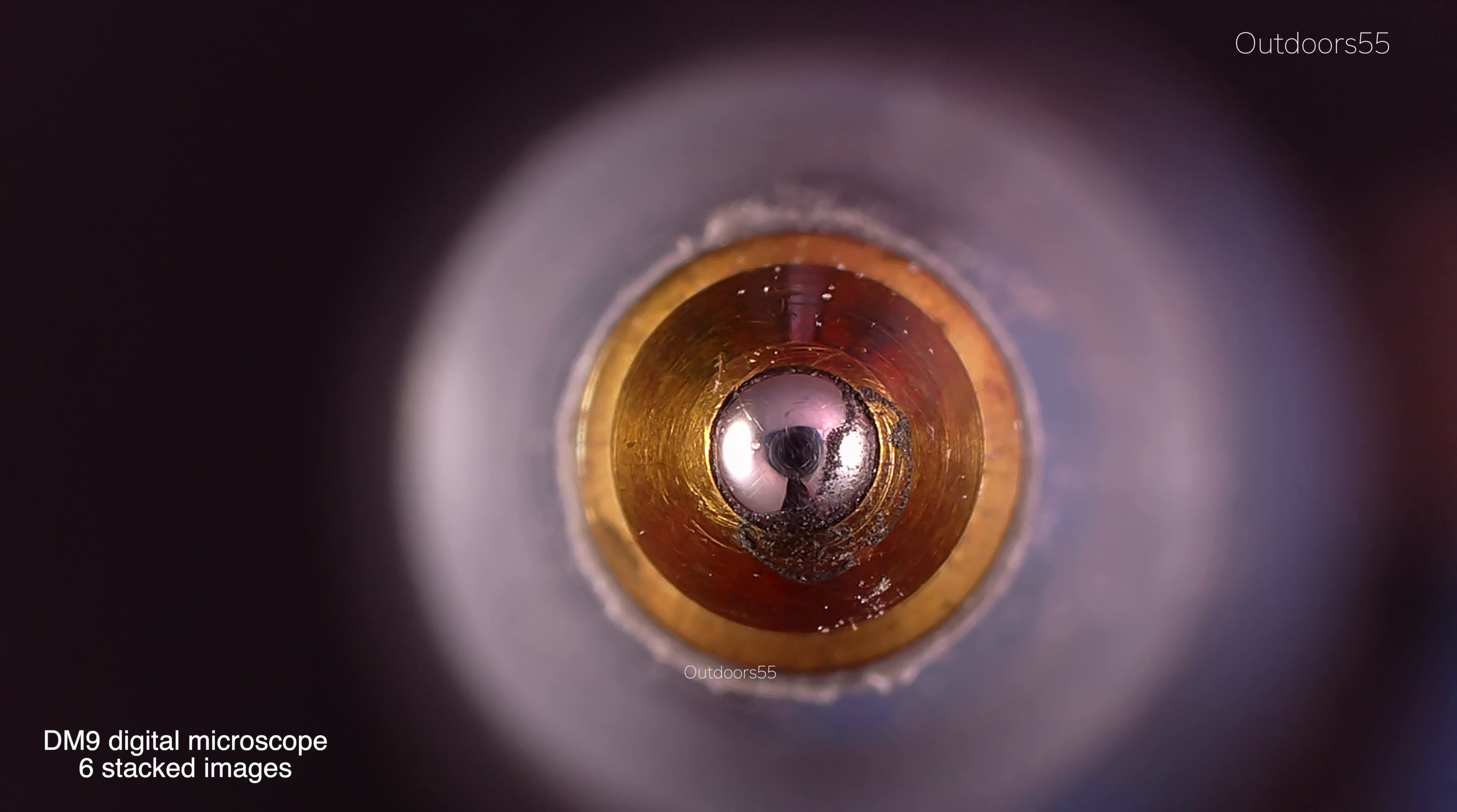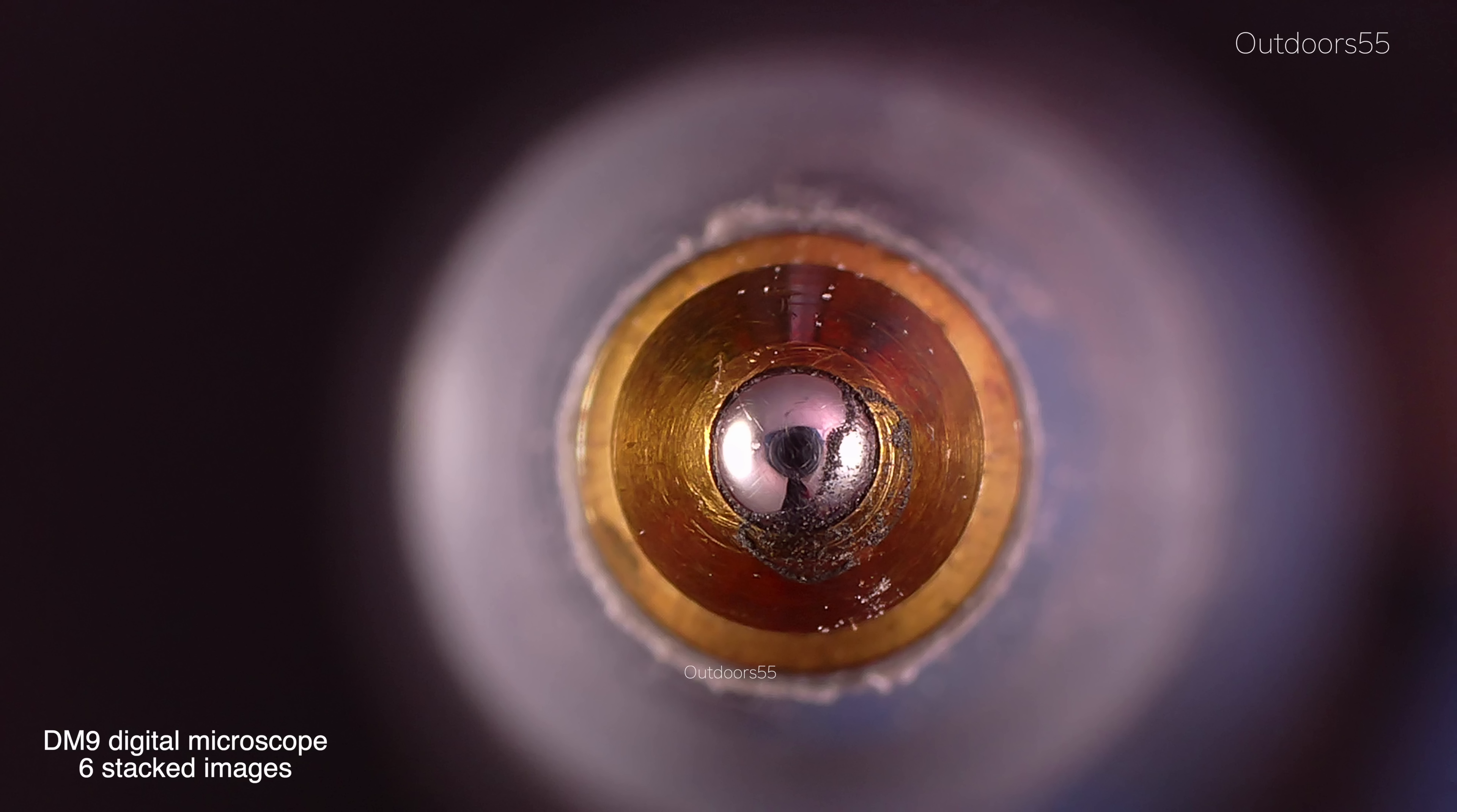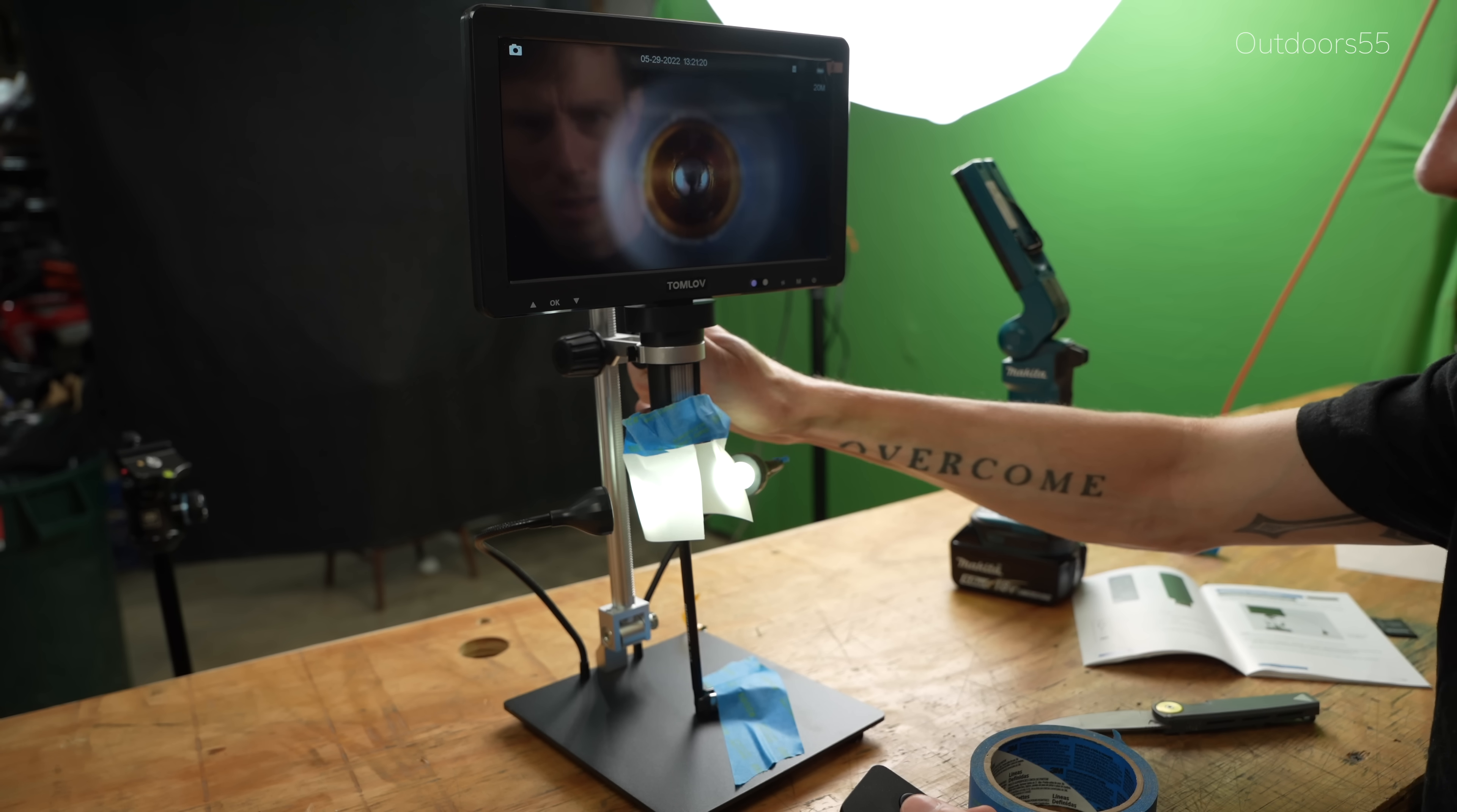Now you certainly can do some basic photo stacking with this microscope. Here's an image of our pen that is six images combined, and it looks pretty good. We certainly do have more in focus than we did before, but it's not easy making such small focus adjustments with this geared rail the microscope is attached to.